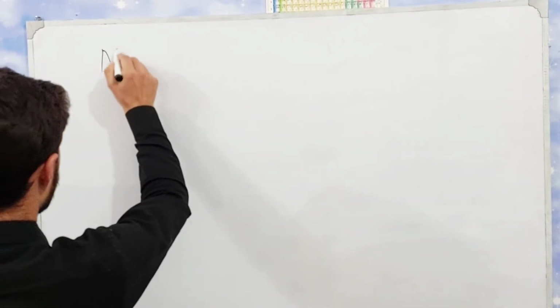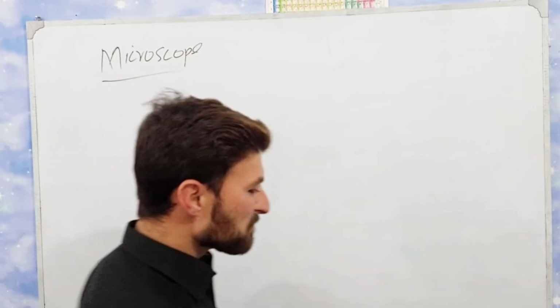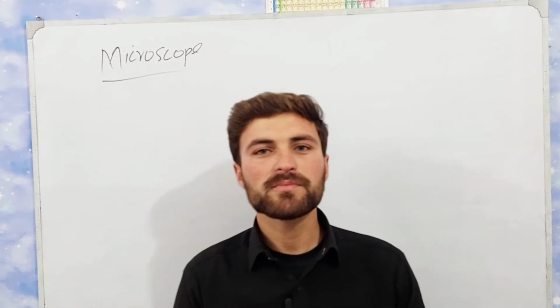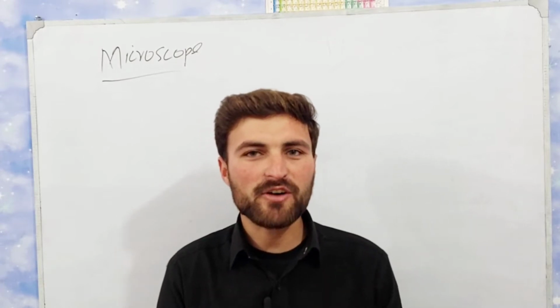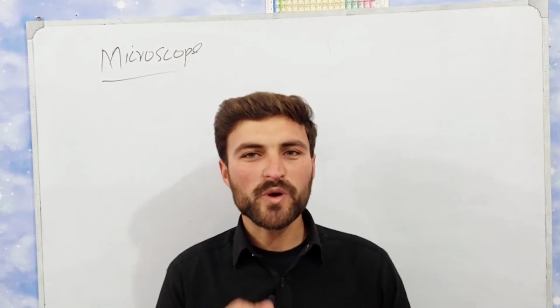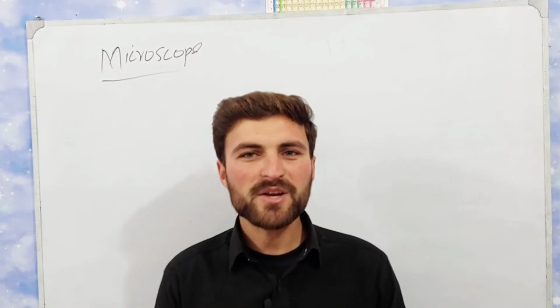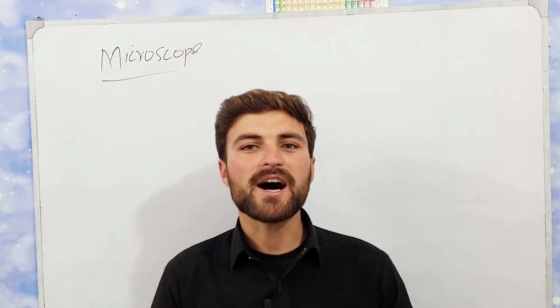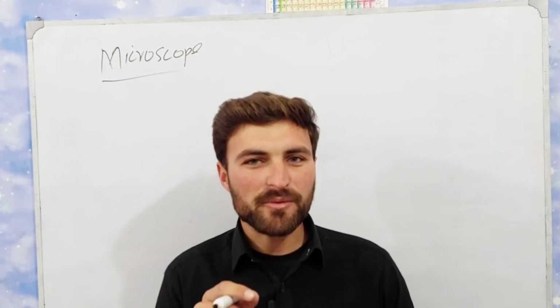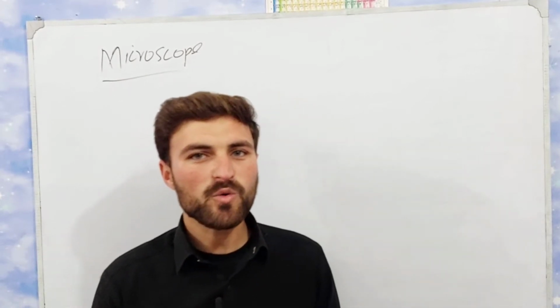First of all, let's know the root meaning of the microscope. Basically, the word microscope is a Greek word, and this word is the combination of two basic words. One is micros and the second one is scopian. Micros mean very small and scopian mean to see, to look or to observe. So from this root meaning we can define microscope very easily. How?